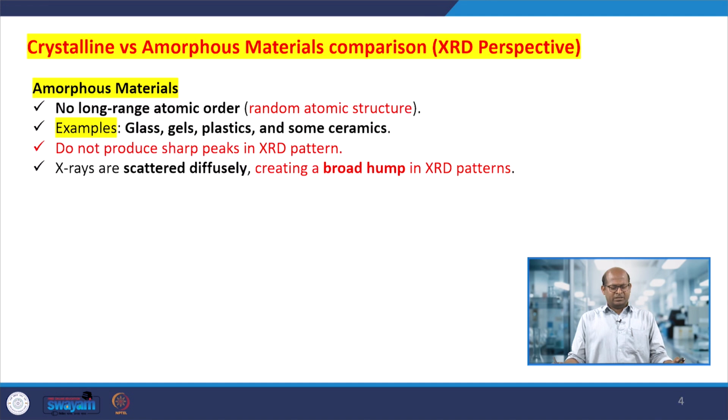From the X-ray diffraction pattern for a particular material, once we analyze it, we can say whether the material is amorphous or crystalline at the specific temperature or conditions we maintained to prepare it. If the material is amorphous, the atoms are randomly distributed and there is no specific order of arrangement. Therefore, the pattern has no sharp peak; instead a broad hump is present in the XRD pattern of amorphous materials.